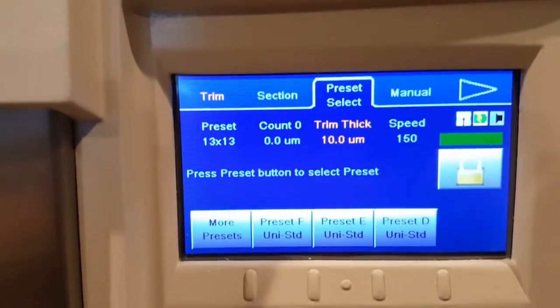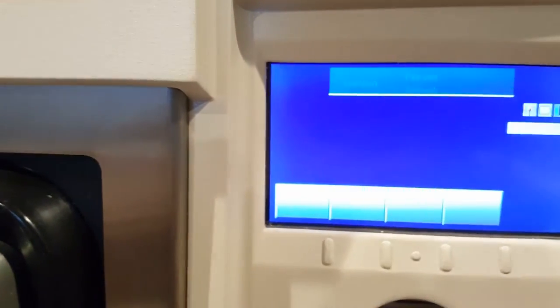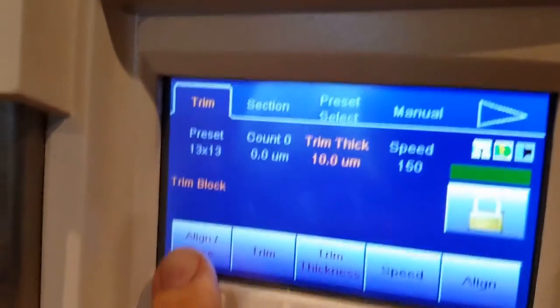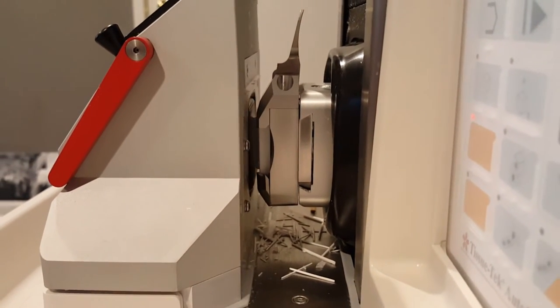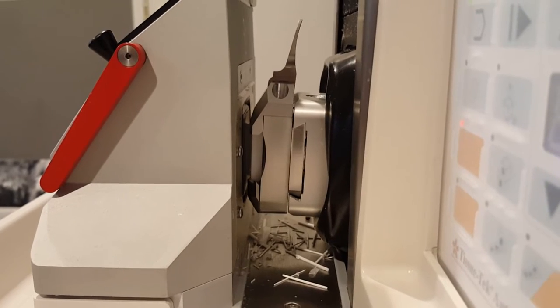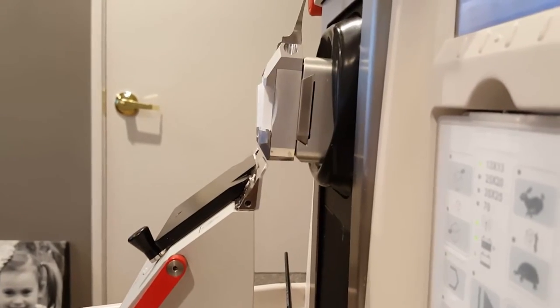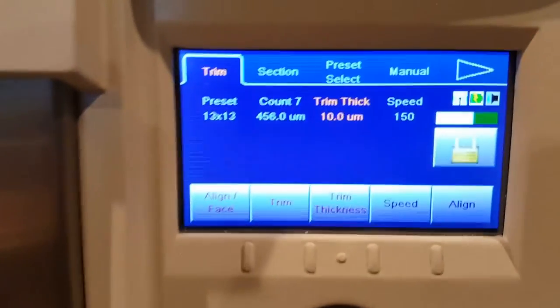Now that it's all powered up, what we'll do is go to trim, and you can see the align face button. I'm going to get over to the right here so when I push that I can get a good look at what it's doing. Now the block face is right up to the blade edge.